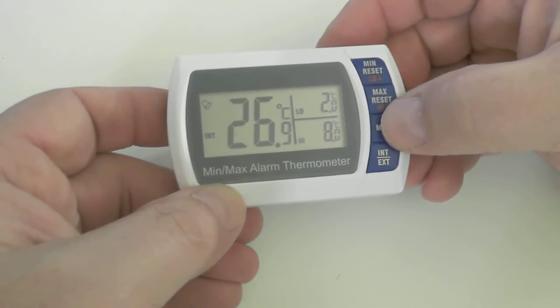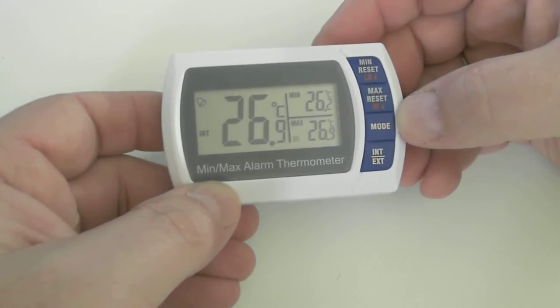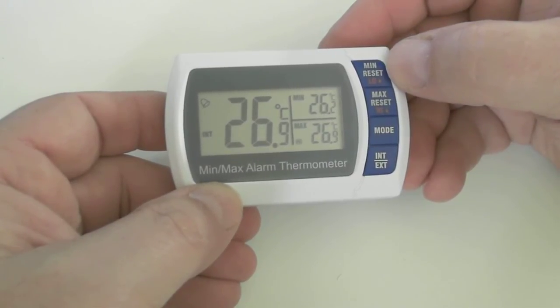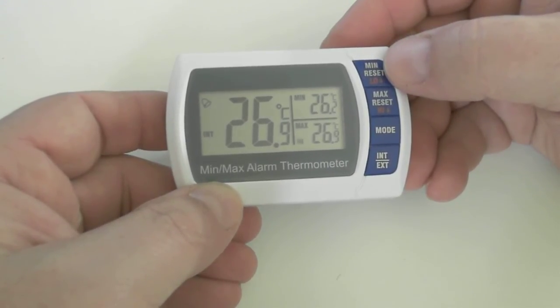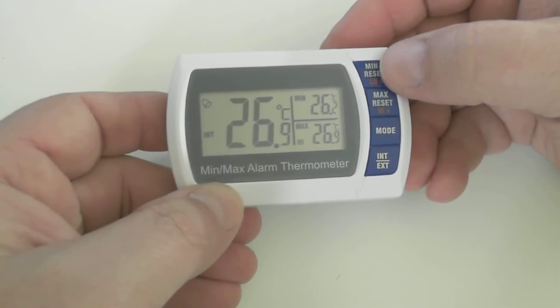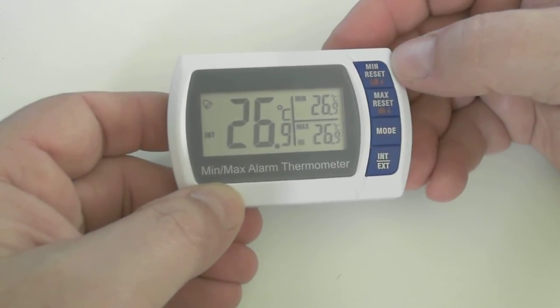Hit the mode button and we're back to the main display of the current min and max temperatures. If you want to reset the recorded temperatures to the current temperature, just hit either the min reset or the max reset. In this case, you can see the min is recording at 26.2. If we hit the min reset, that will set it to the current temperature — and there it is, 26.9.